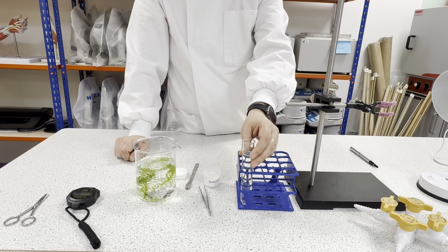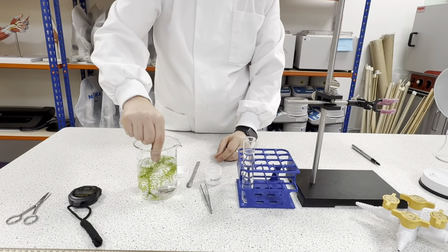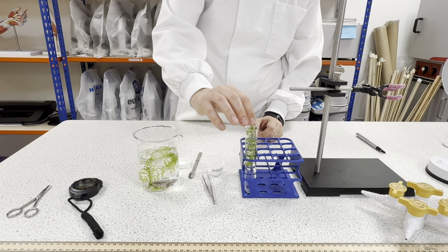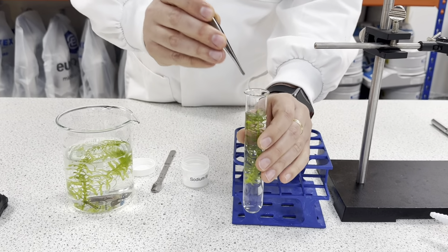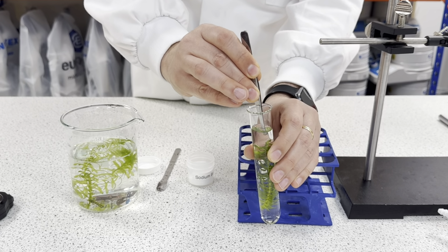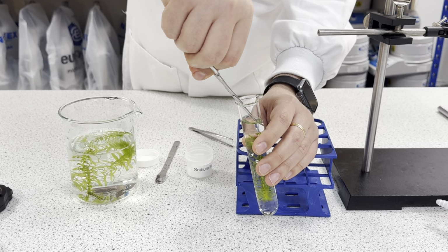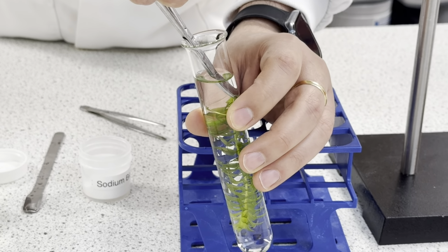Now I place it back here, and then I will pick my pond weed. Something very important, when I place my pond weed inside my boiling tube, I will use my tweezer to push it down. When it's completely submerged, using my scissor, I will cut the edge of my pond weed.